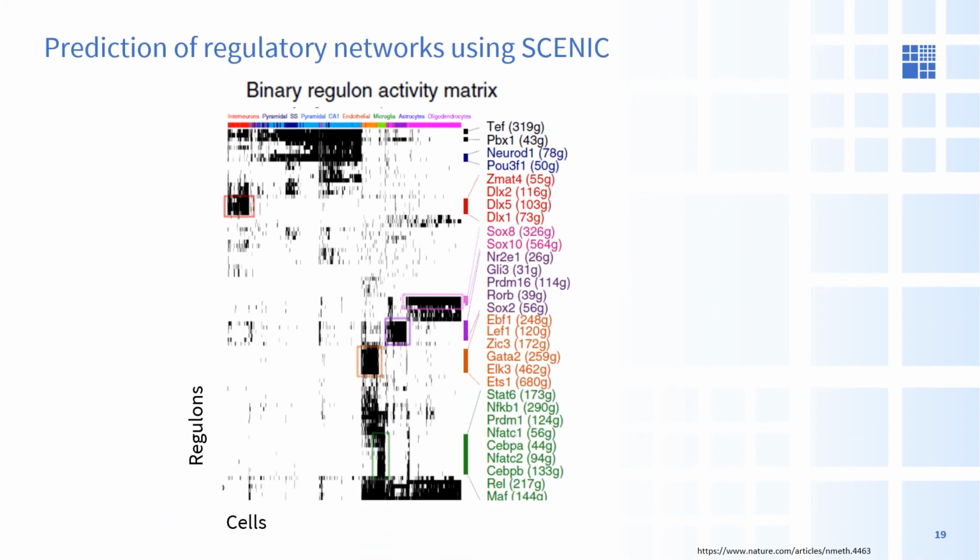In addition to pseudotime analyses, gene regulatory networks can also be constructed from single-cell data. Now, typically you hear about GO and KEGG pathway networks, but today we're also going to talk to you about using the SCENIC functions.